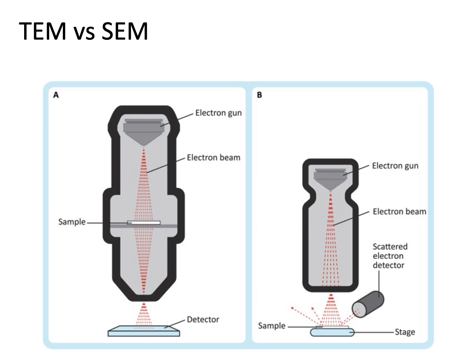That's what you would put on the sample, right? Your electron beams are cast down from above, and then they scatter based on the shape of the material. The detector can then interpret that. So you might think about it like if you were to cast down signal upon a street with drains and a manhole, and a cone was on the street. Electrons that went down into the open manhole would disappear. So those would be lost and gone from a detector and would show up like a dark hole.